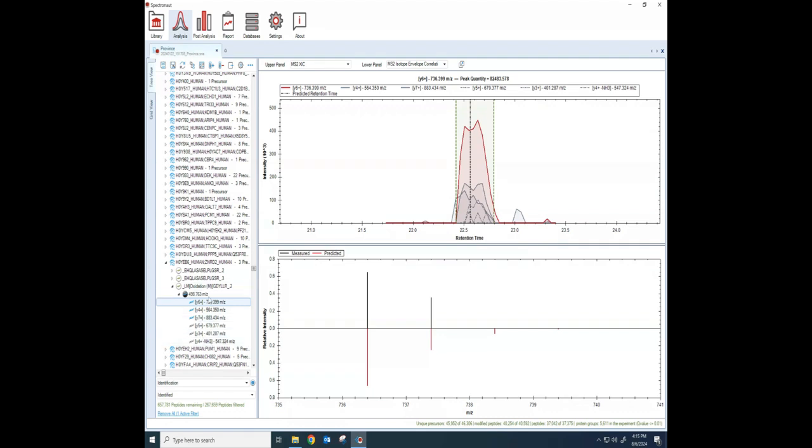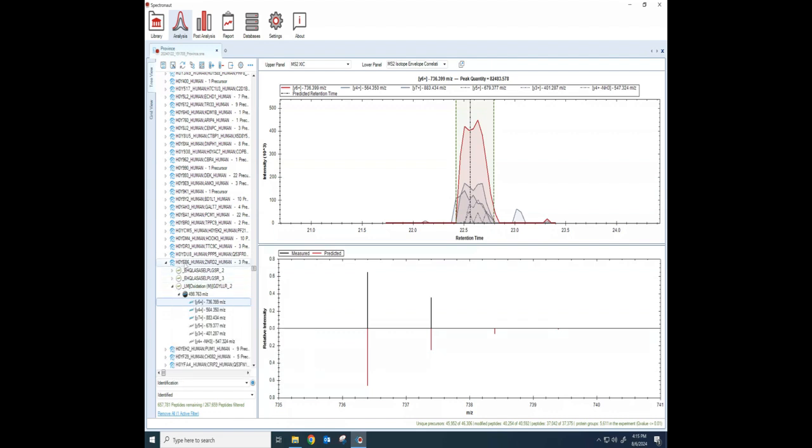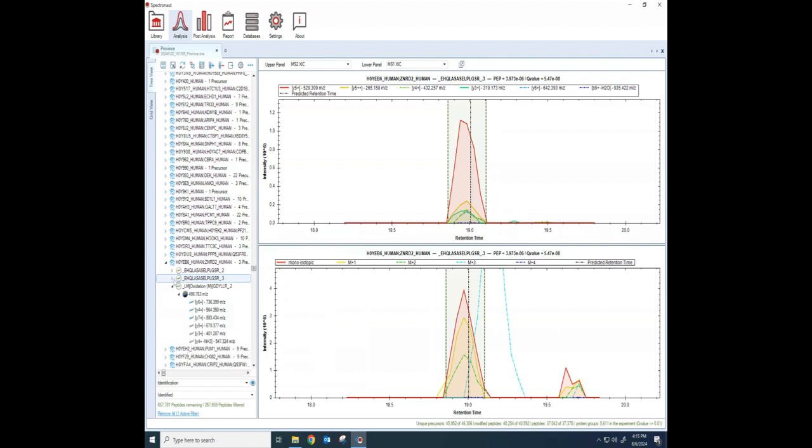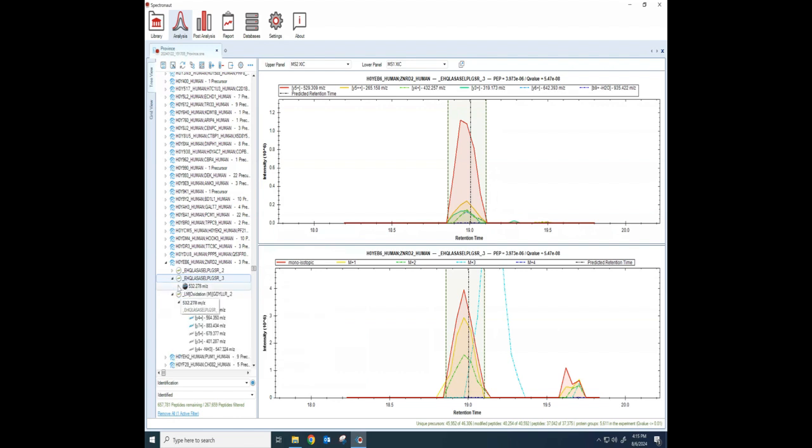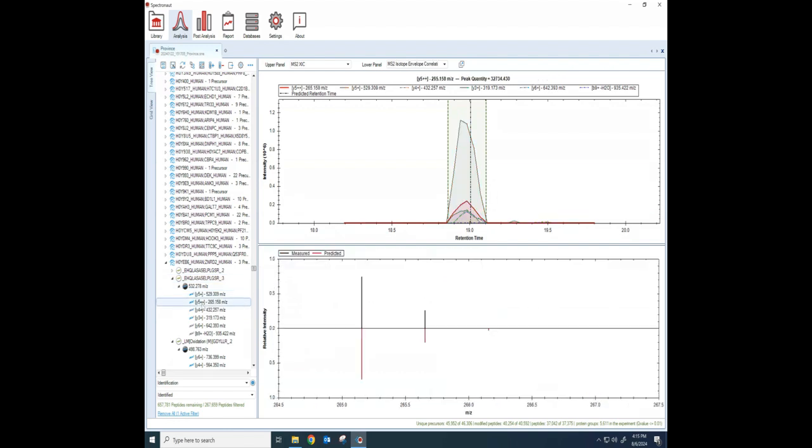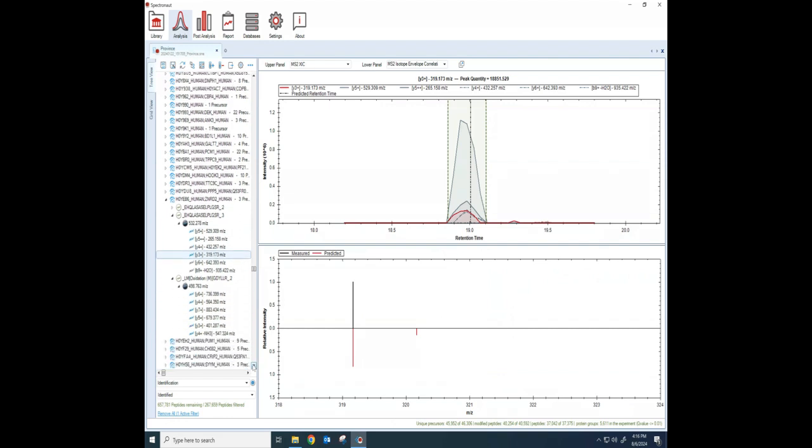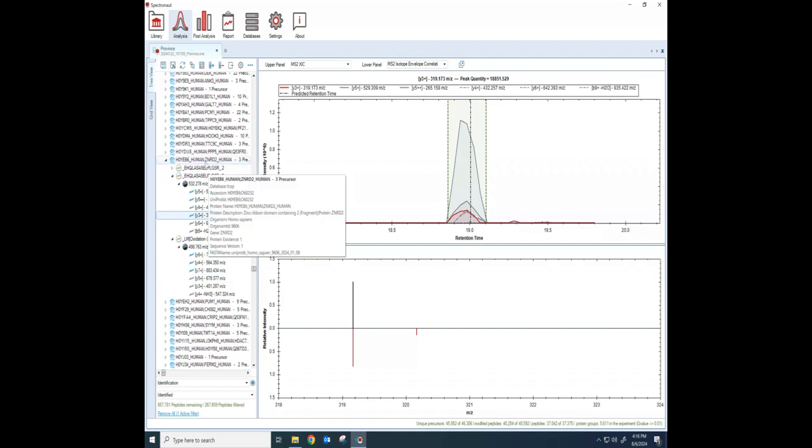The more this looks like a Gaussian peak, because we have lots of measurements, lots of data points here, the better the quantitation is. The more it looks like just a triangle, because we only have one or two points underneath the peak, the worse the, the bigger the error is as we calculate that area underneath the peak. You can see that it had six different fragments that it could measure for this particular peptide. And you'll notice that that's just one peptide for this protein. There's another peptide here. And underneath that guy is even more fragments that we can look at and see which ones they used.